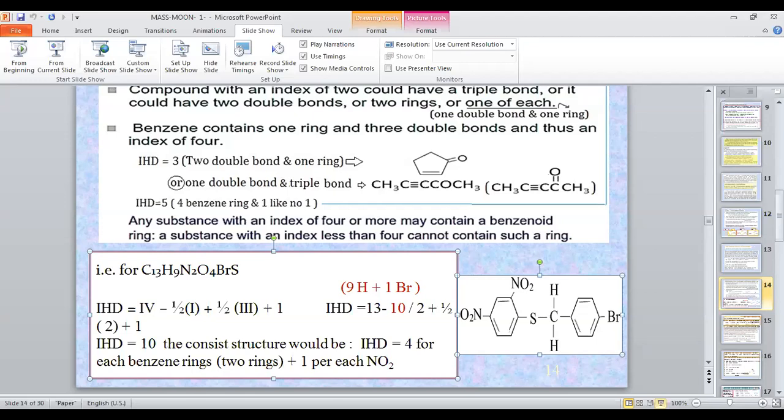From here, I have a compound, and this compound gives me peaks at 77, 112, 114. Look, if I have 2 peaks and the difference between them is 2, in other words 112, 114, the difference between them is only 2. That means I have an isotope related to halides. That means within my compound I have a halide. If the ratio is 1 to 3, 33 to 100, that means the type of halide will be chlorine.